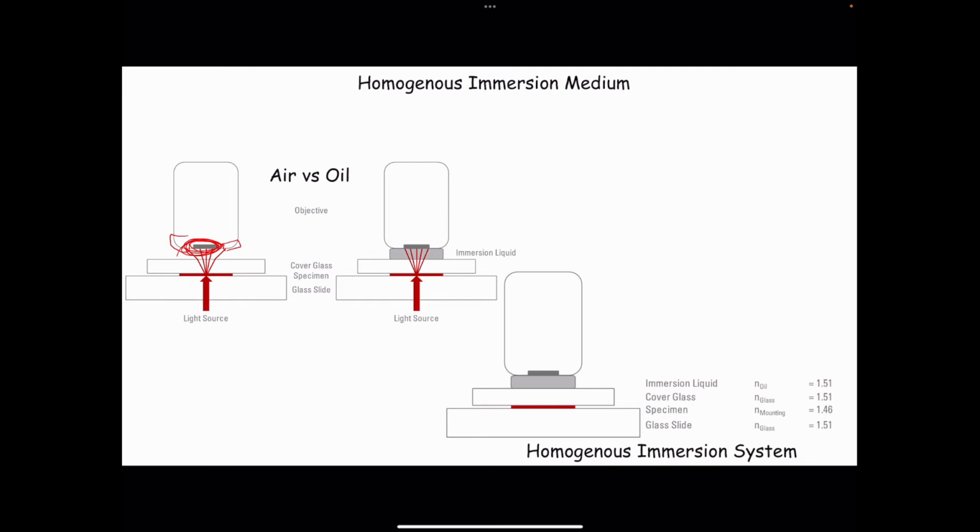Now in this case, I would draw many more rays also, and they will come here and they will diverge here. So there will be a part of the rays which goes out into the air because it is getting diffracted and lost, or there will also be rays of light which hit the metal mounting of your objective, as a result of which they get blocked, and this metal housing of your objective front lens does not contribute to the image formation.